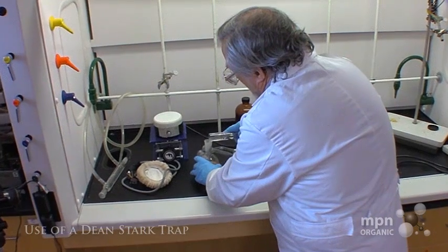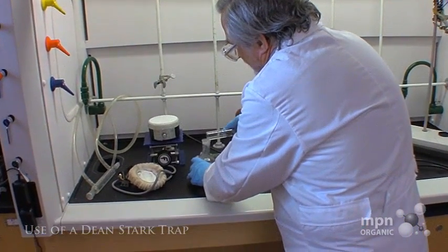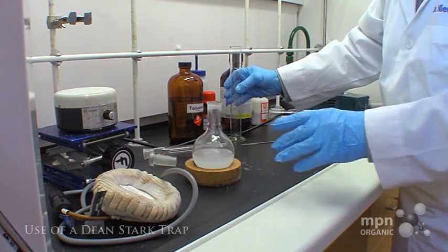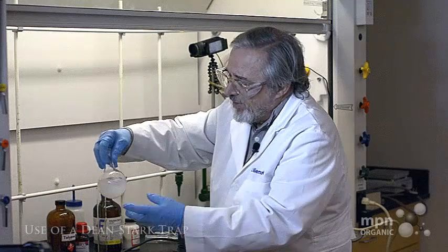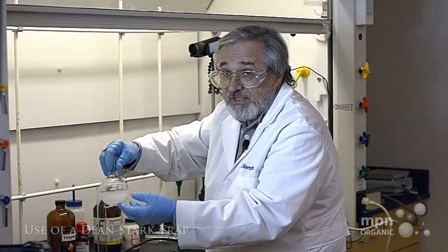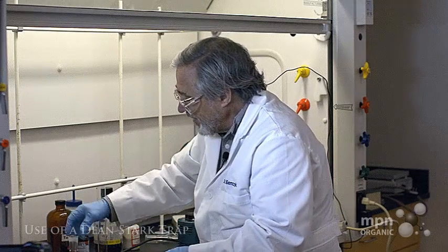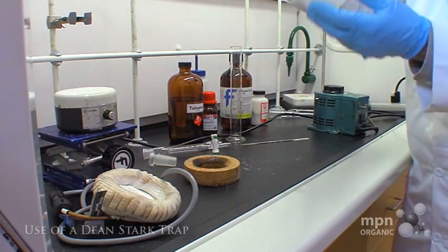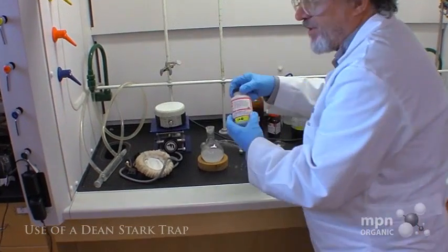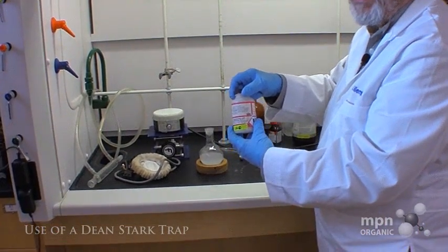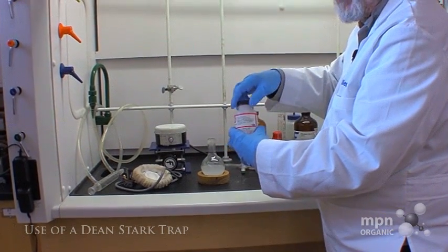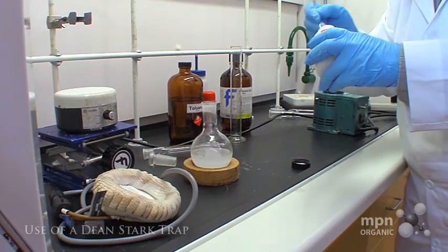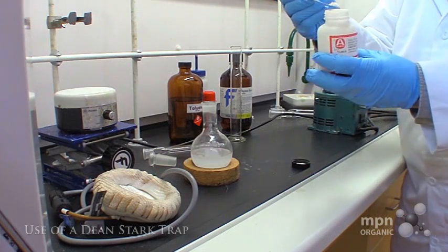We'll just add the toluene in there. I've got my toluene in there, and once again the ethylene glycol is not going to be soluble in the toluene. I'm going to carefully put my stirring bar in there, and then I'm going to add the catalyst, the p-toluenesulfonic acid. The reaction will not go without the p-toluenesulfonic acid. I'm going to add a few milligrams—that's about it.